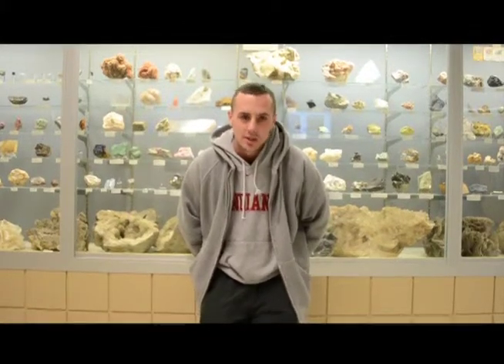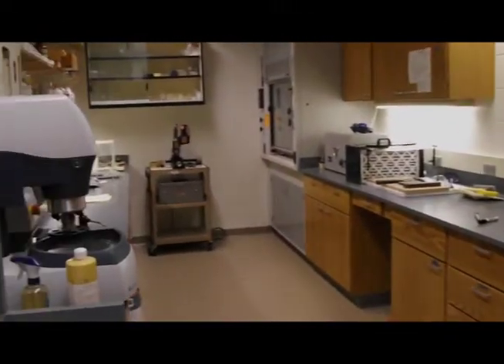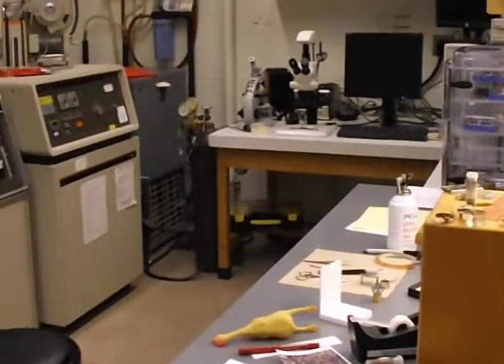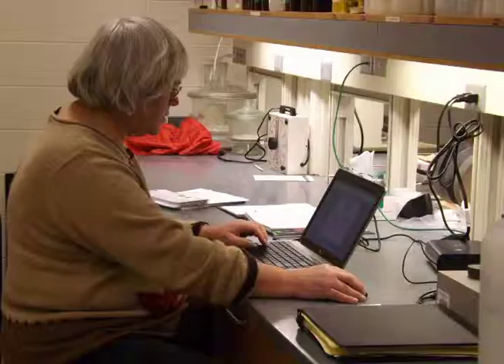My name is Dan Steven. I'm a senior at IPFW and I'm a geo major. I'm in the SEM class, which stands for the Scanning Electron Microscope. What we do is we take samples, we either prepare them or we have them prepared from Argast.